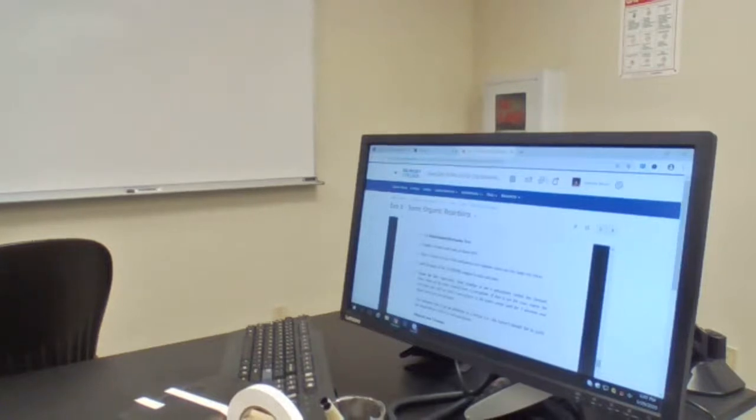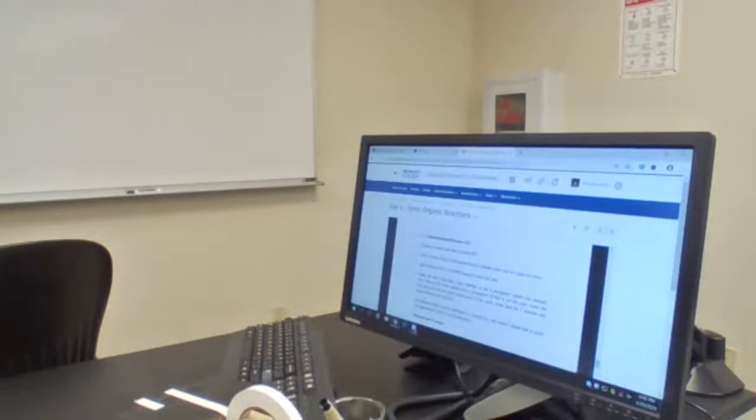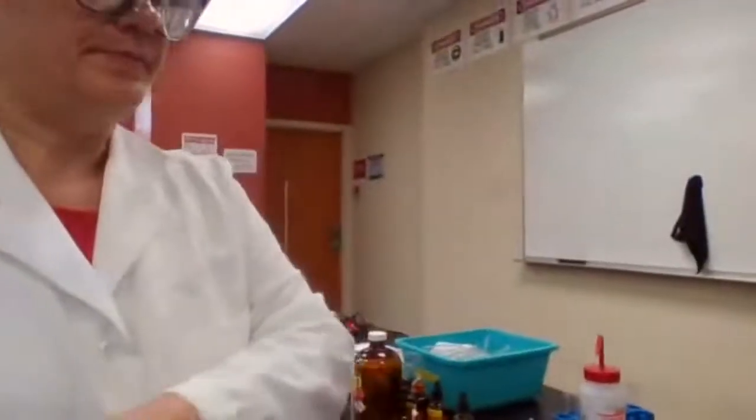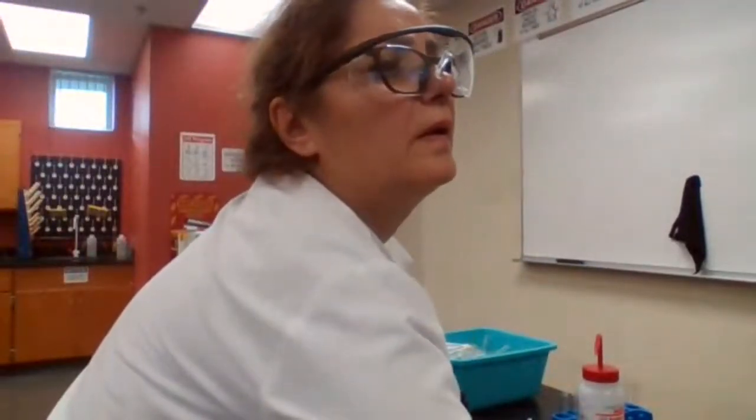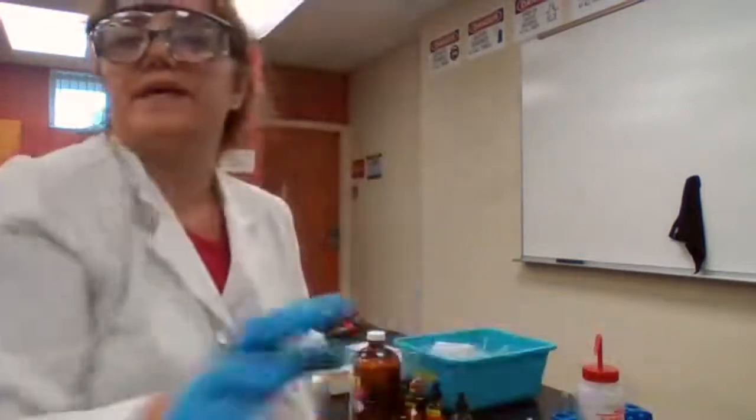Next part of the experiment. What's next? The iodoform test, okay?